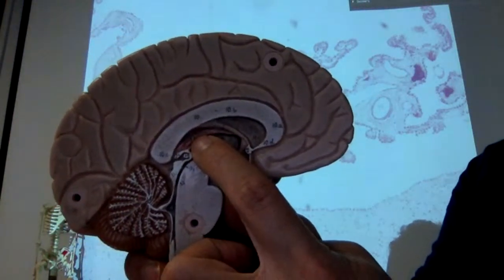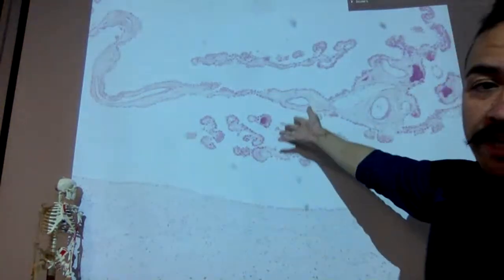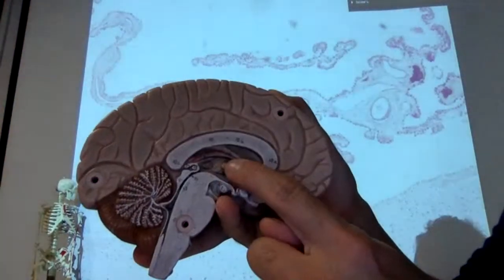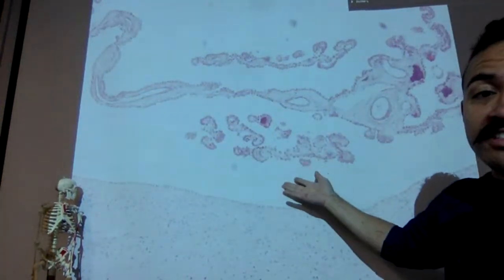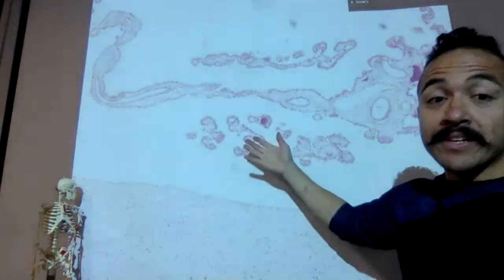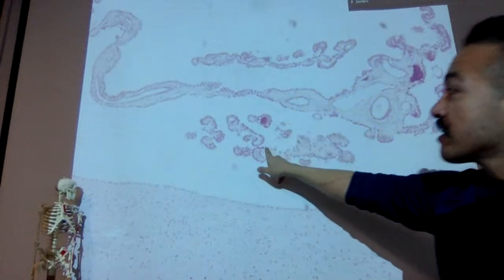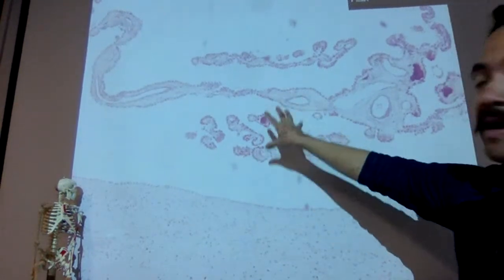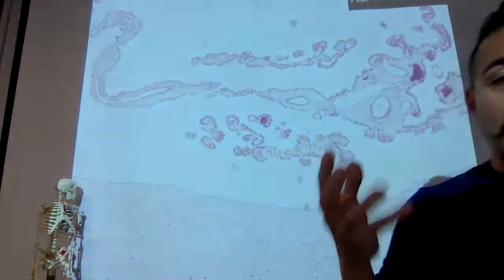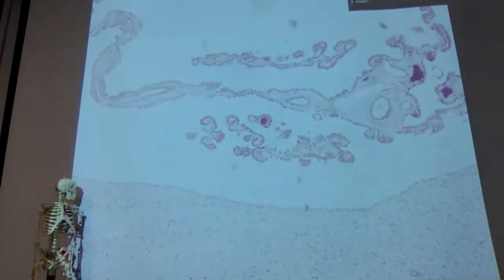This thing within the ventricles is called choroid plexus. Choroid plexus is what you see here. And again, you find it in ventricles of the brain, those spaces of the brain. Choroid plexus is lined with the ependymal cells. Ependymal cells are the ones producing cerebrospinal fluid. This is where cerebrospinal fluid is being made. These cells that are lining in this space. You see how much surface area there is so they can keep generating fluid. They're surrounding blood vessels to take nutrients and water out.